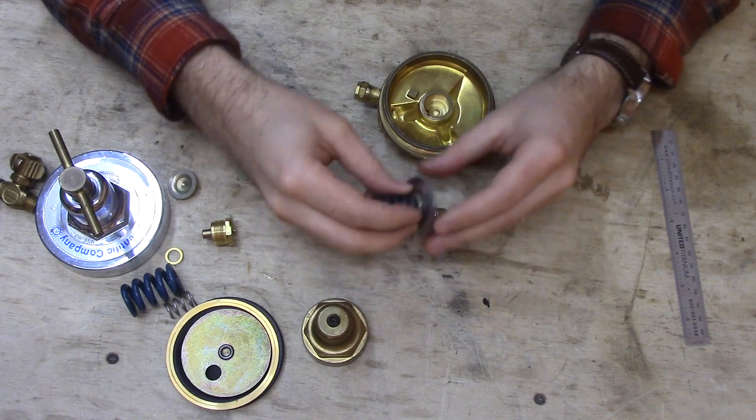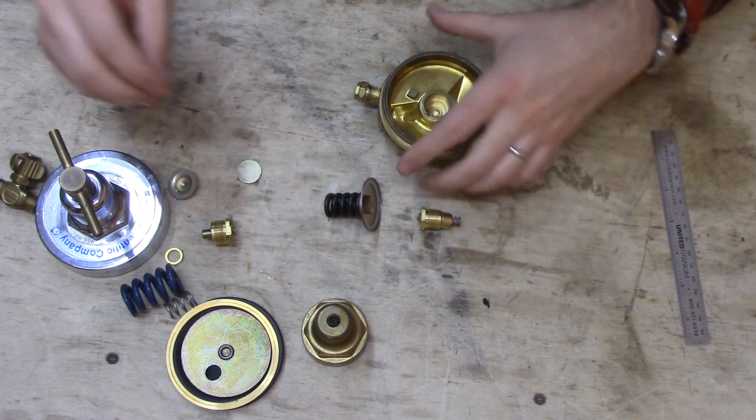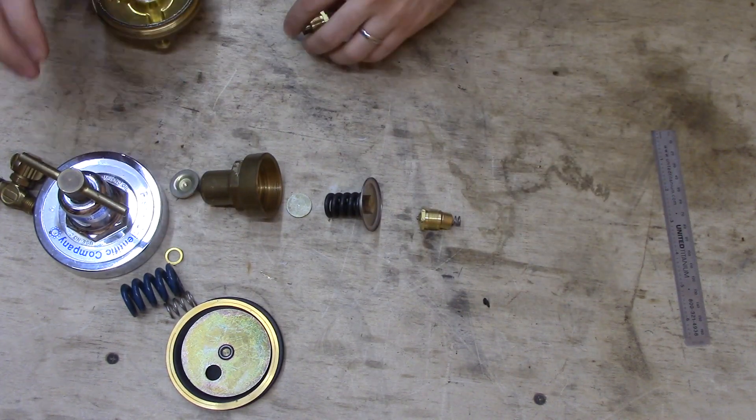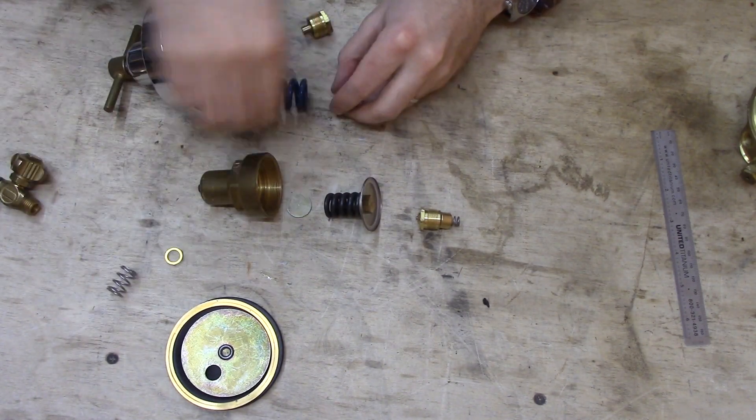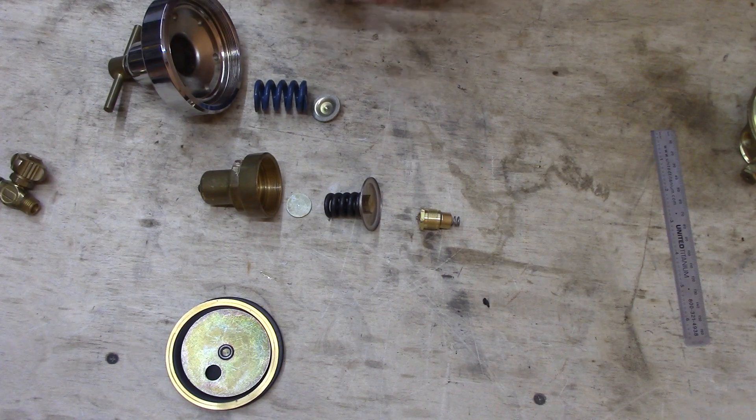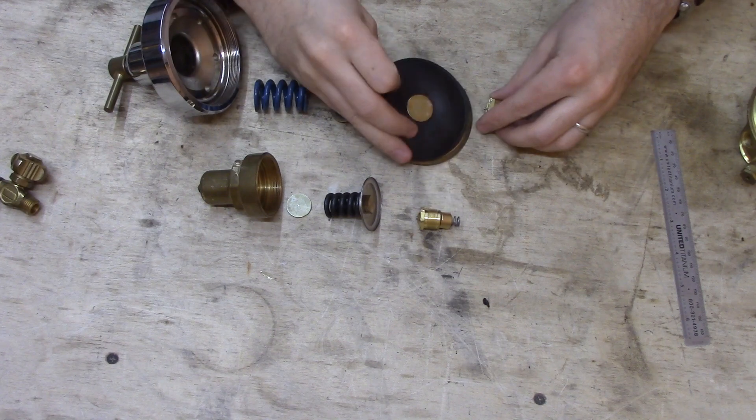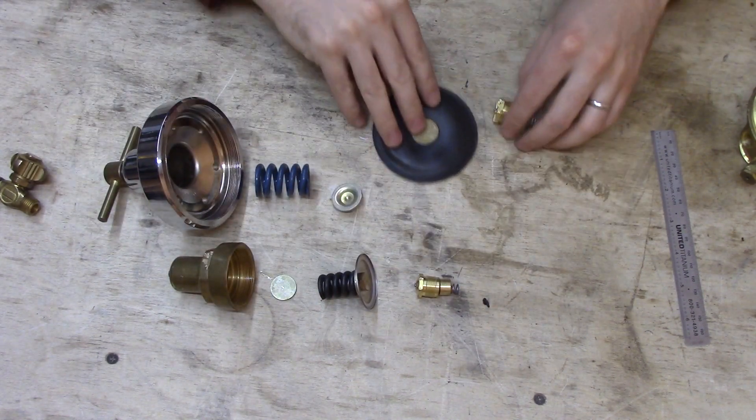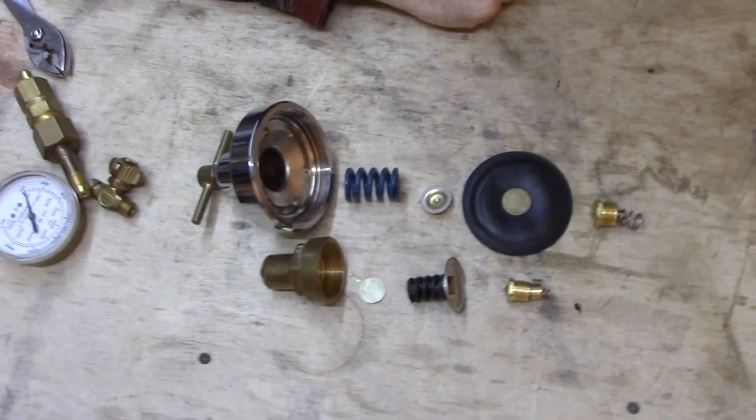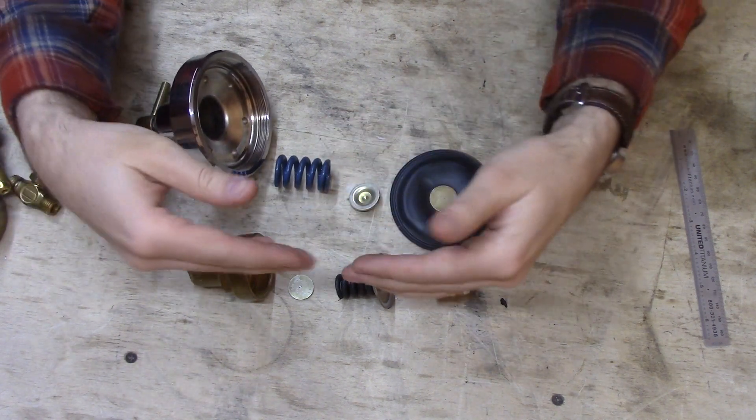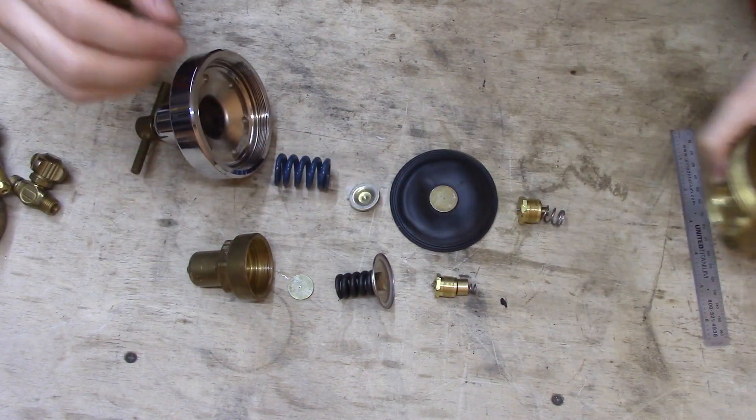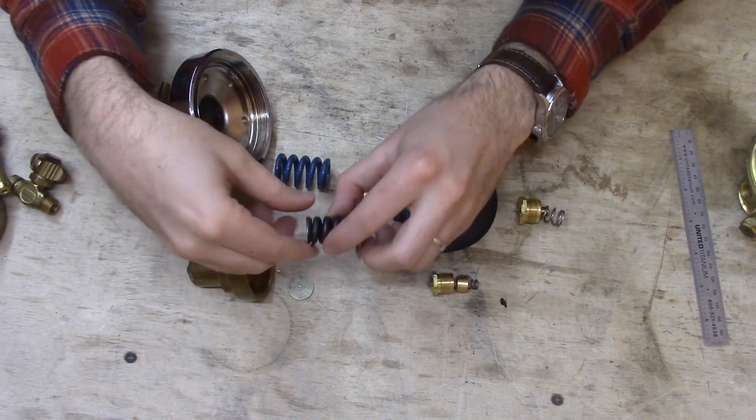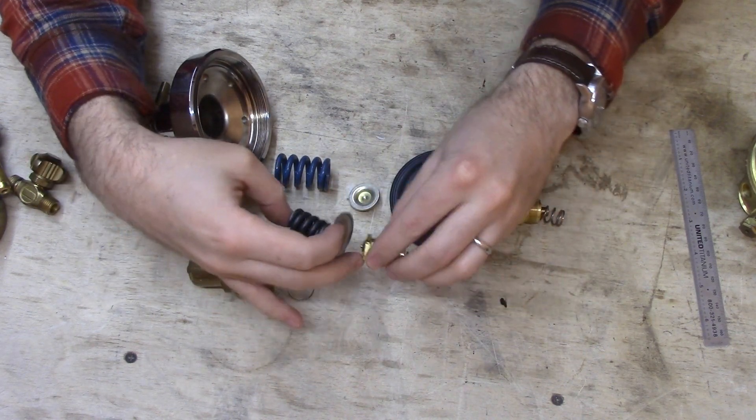So kind of laying it all out, these are the components of the first regulator stage, and then these are the components of the second. So laying it all out, you can see the gas enters this first chamber on this side of this first stage diaphragm. It keeps coming to this chamber until the force compresses this spring enough to let the valve close.